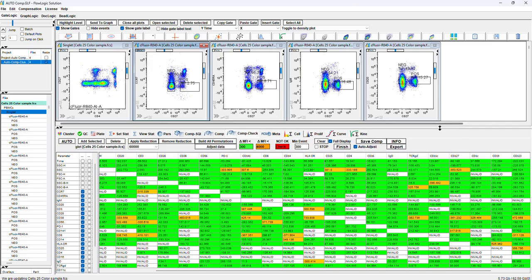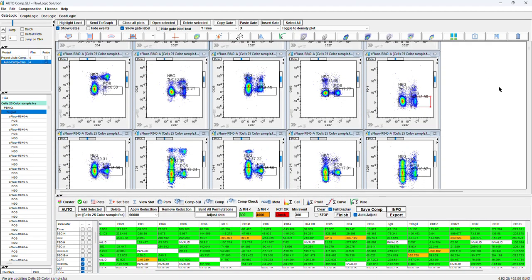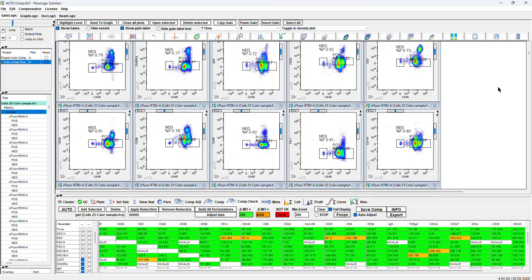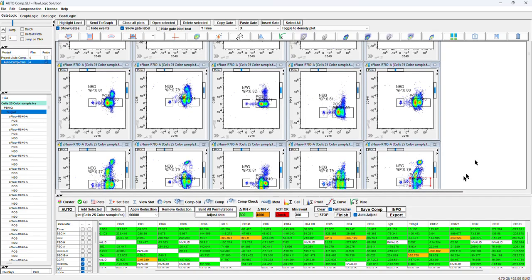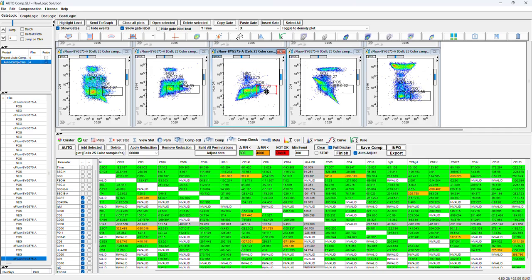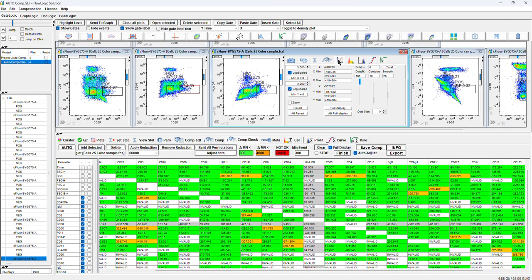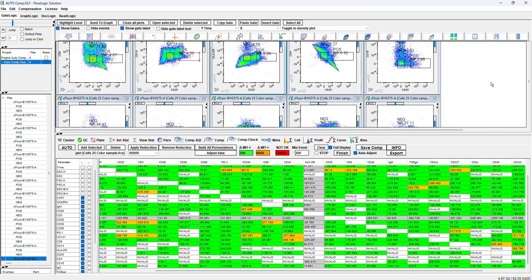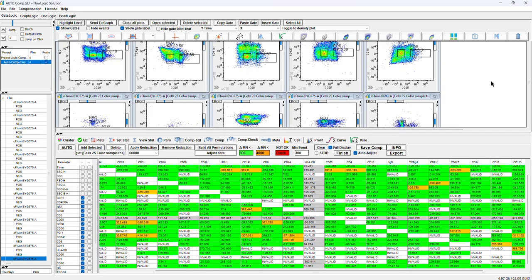There are two options here. One option is just scrolling and visualizing your data, and if you think it is correct, it's okay. The other option is to select and say, okay, is this okay? This is correct. If you are not happy, you just open the side row and you can do an adjustment and match. So up to you. When you finish your check, just click finish and FlowLogic will change everything.